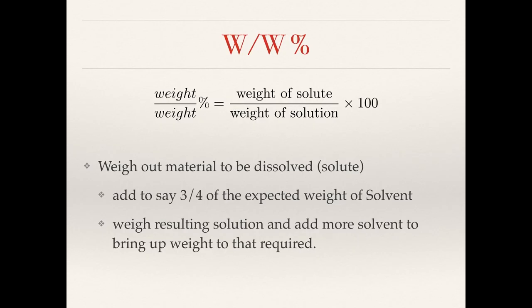The weight-to-weight percentage is possibly the least frequently encountered percentage solution type, but it's also the most frequently misunderstood. A common mistake when making up a weight-to-weight solution is to weigh the solute and then weigh the solvent and combine them. This is incorrect because the percentage is the weight of the solute over the weight of the solution — and we have to remember the solution is the solute and the solvent combined. Typically to prepare a solution of this type we would weigh up the solute and then weigh up maybe three quarters of the expected weight of the solvent and combine the two. More solvent can then always be added to bring up the weight of the solution.